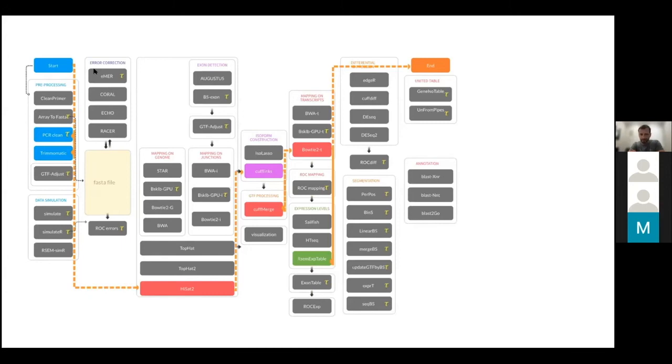Okay, 151, 3. The truth is, it's between 30 nucleotides and about 350. There are some long read sequencers that now sequence up to maybe thousands of base pairs, but typically we're going to be dealing with anywhere between 50 and 150. So let's take a look.